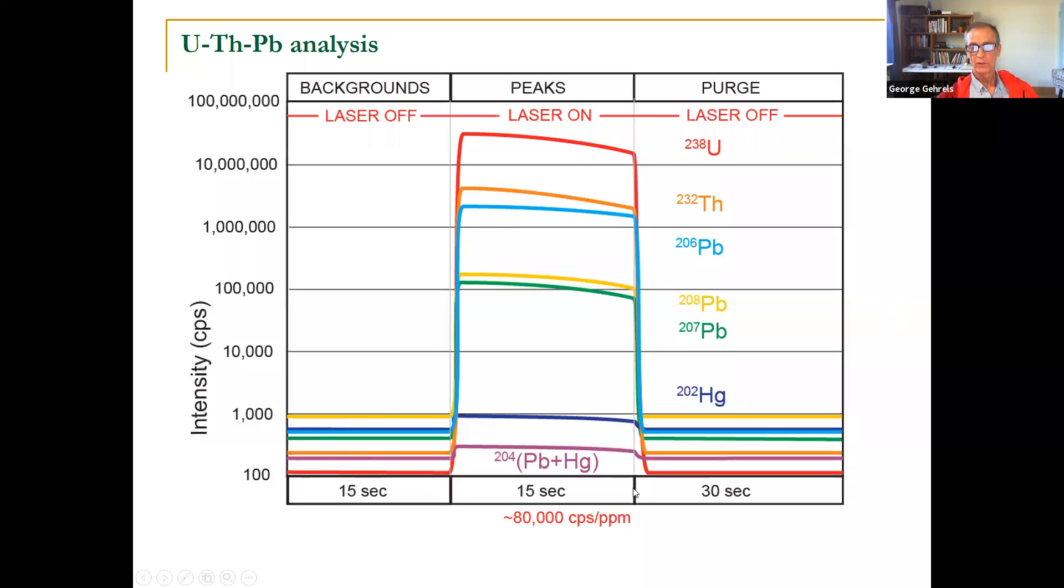So then you fire the laser right here. We might fire the laser for about 15 seconds. See lots of 238, a little bit less 232. You see some lead 206, 207, 208. You see some 204 down here in purple. You see some mercury. This is the challenge. There's mercury 202 and 204. What you also see on here is that the intensity decreases as you're drilling down into the zircon. The intensity comes down a little bit. And also the change in intensity for uranium is actually a little different than it is for lead. Lead and uranium behave differently as they come out of the laser pit and go into the mass spectrometer. So we're going to have to do another correction for that.